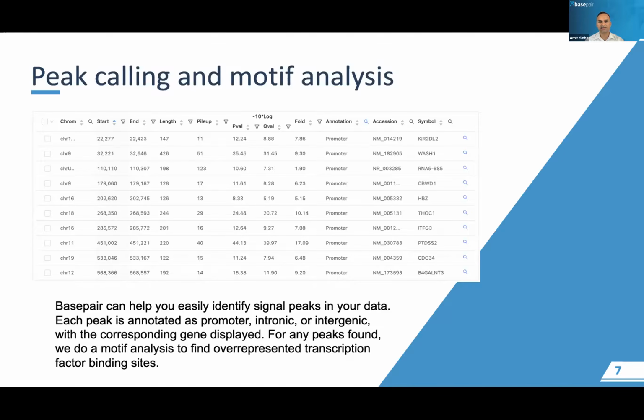And then we associate these peaks most frequently to the nearest gene, as long as the nearest gene is within 100 kb. And if your interest is in downstream finding the genes of interest, then it makes sense to find the promoter peaks, find the genes they are nearby, and then those genes are the ones which are likely to be affected by the epitope of interest. The gene annotation could be further broken down into intronic and exonic as well, as the case may be.